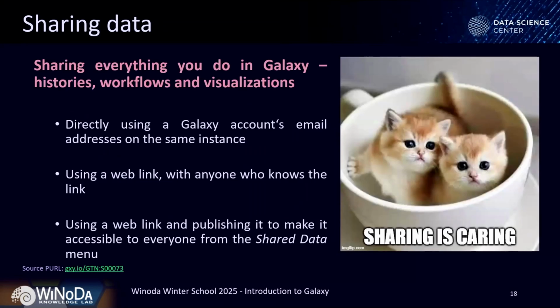Sharing is caring. So you can share everything in Galaxy. As long as you don't share, only the Galaxy admins have a possibility to look into that. They usually won't if you don't ask them to, at least on the European server. You can share, for example, directly using another person's Galaxy account and share that with their email address. Then they will get access on the server to your history or workflow. You can use the web link that anybody who has this link can access, or you can publish on the Galaxy server where everybody can access that from shared data.